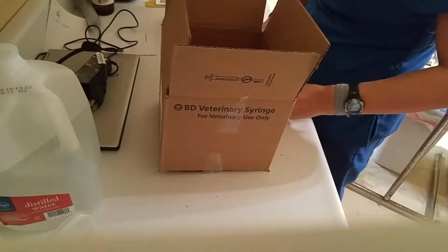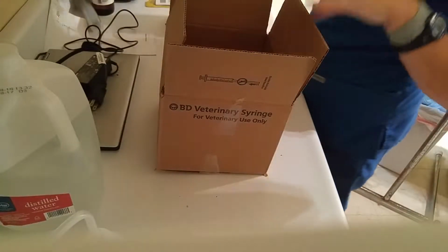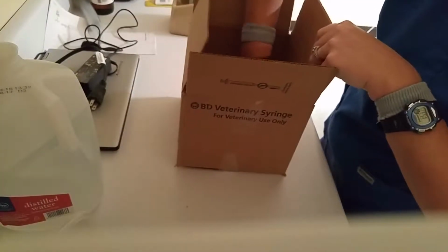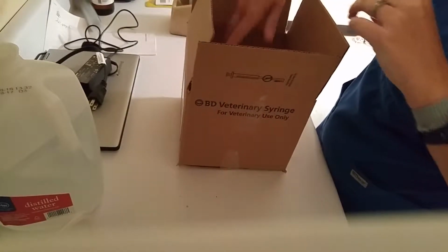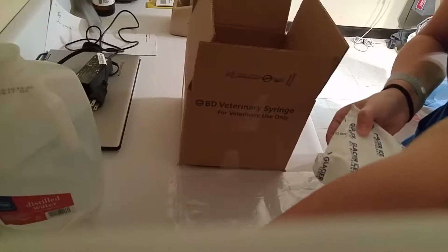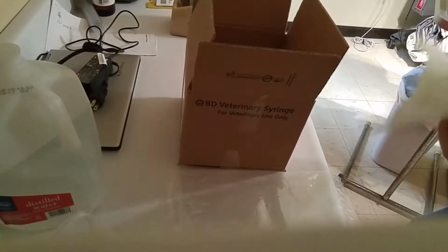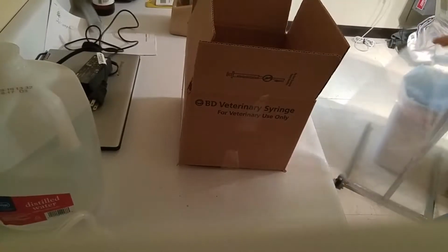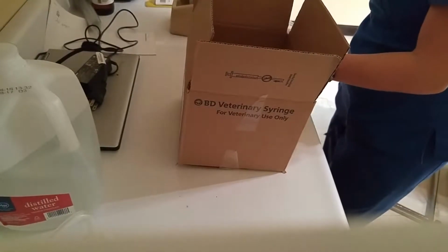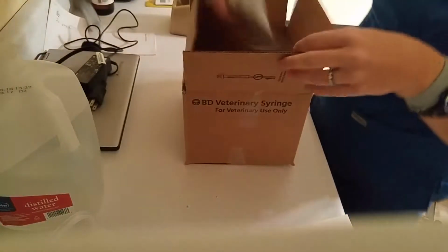It is sitting in formalin, so make sure we lift the bag up really well. We're going to stick it in the box. I'm going to put a couple extra paper towels in there just for stableness. And then we're also going to get an ice pack. I'm going to do the same thing, wrap it in some paper towels, put it in a bag. This way it's nice and cool. Sit that in there. Make sure our requisition goes in here.